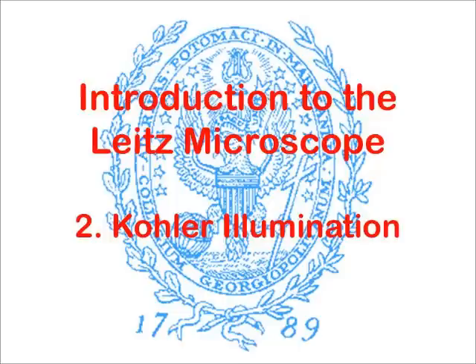Now that I have gone through the components of the Leitz microscope, I'm going to turn my attention to how to set it up for Kohler illumination. The term Kohler illumination refers to an old method for adjusting the condenser to optimize both the distribution of light and the resolution. This is particularly important if you plan to take photographs of the slides.